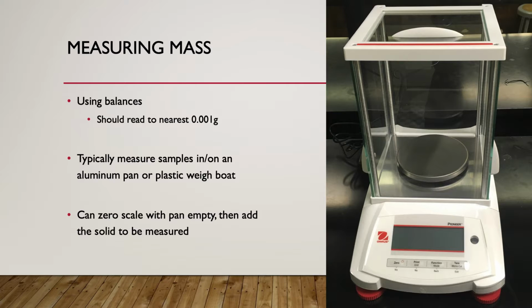Like, if you zero it while it's empty and then put your weigh boat on there and then add your sample, well, that weigh boat mass is now also part of your sample mass. So you do want to be careful. And I think it's, like I said, fairly intuitive. If you do have questions, always ask. You have an instructor and a TA always in the lab that can help you with that part too.